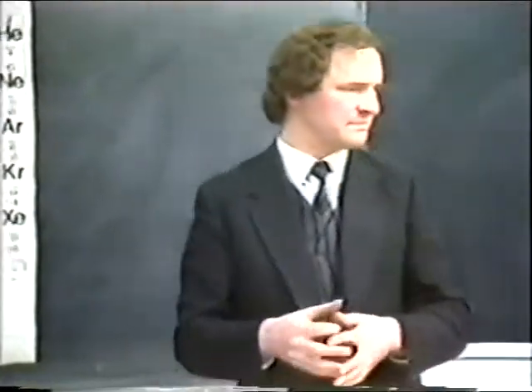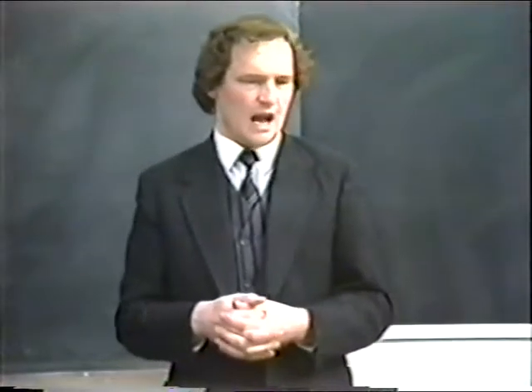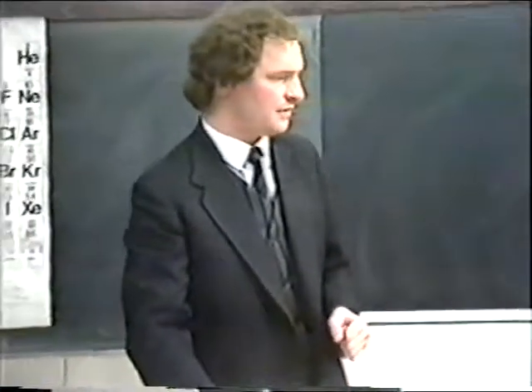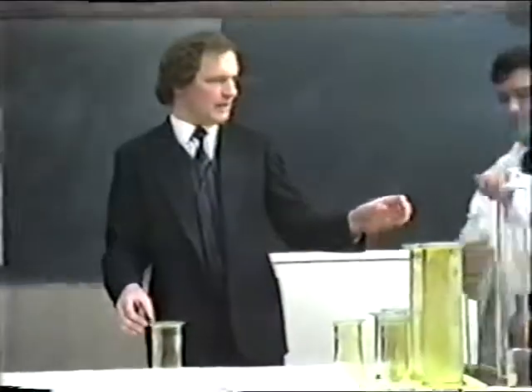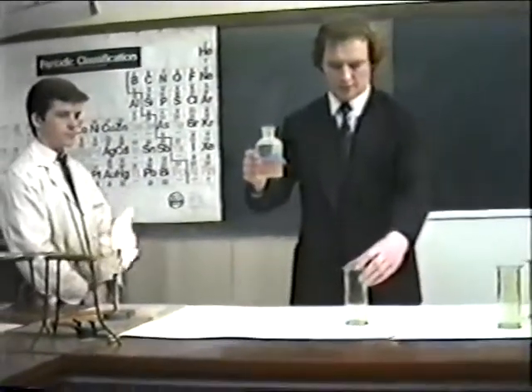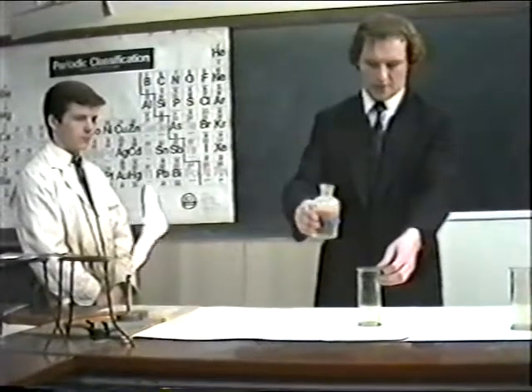What was that, Bernie? One with potassium iodide. Ah, with potassium iodide. Now this is a very interesting colour change. If you allow me to perform it, I'm going to add potassium iodide solution, which you notice is colourless, to a solution of green chlorine in a gas jar.